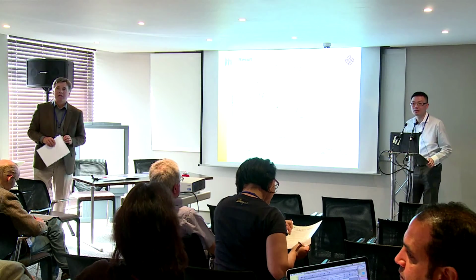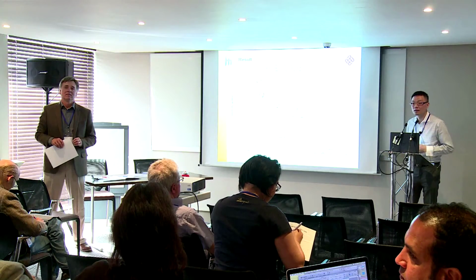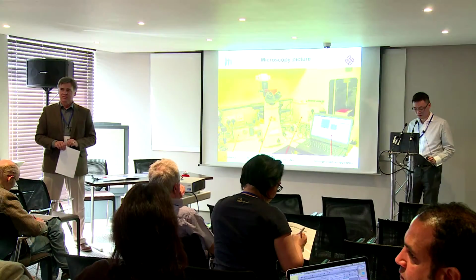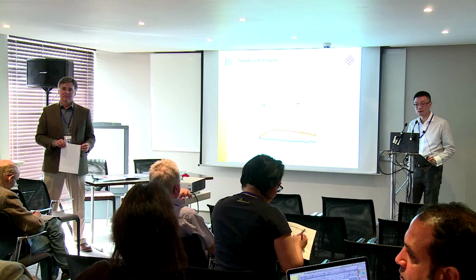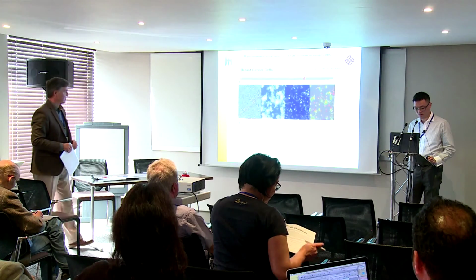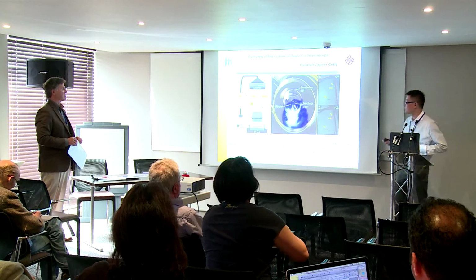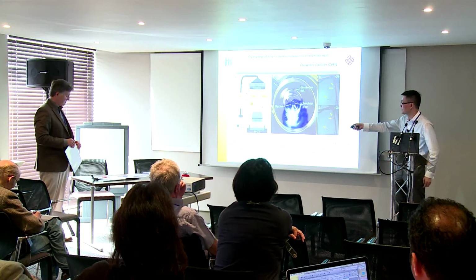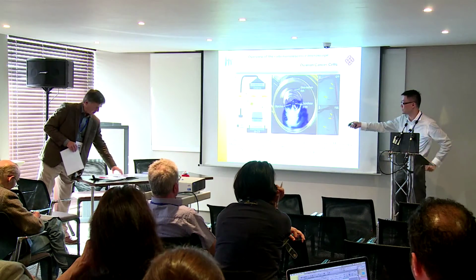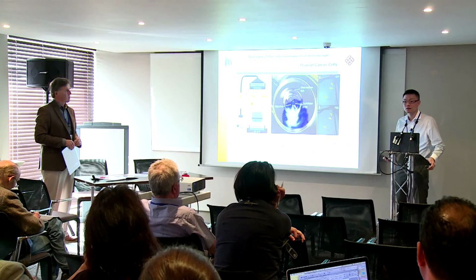What's the difference in the mechanism of the FDG versus the fluorescent one? Is it only looking at the glut receptors, or is it looking downstream? Maybe I can show you this. The difference is the setting of the microscope. They need a scintillator plate to convert the signal for the FDG to visible light, so it becomes a fluorescent signal.